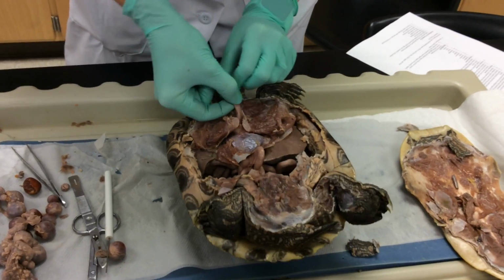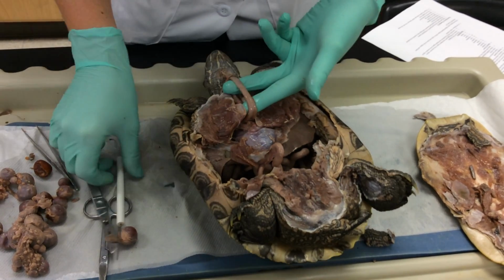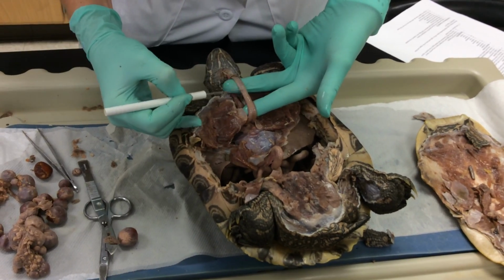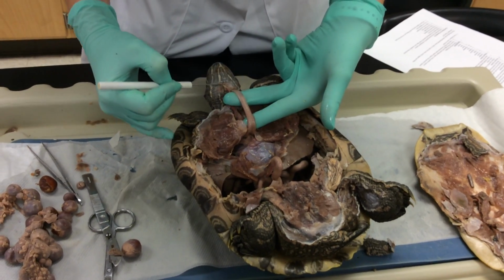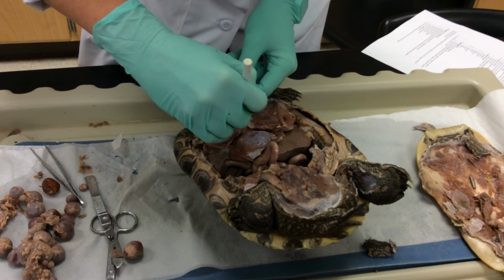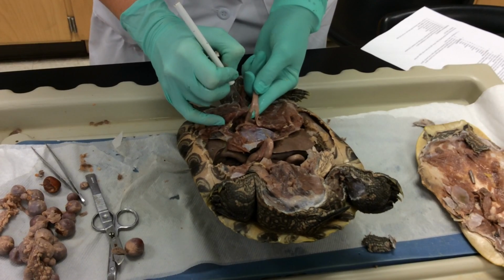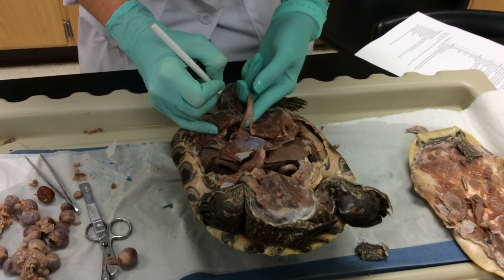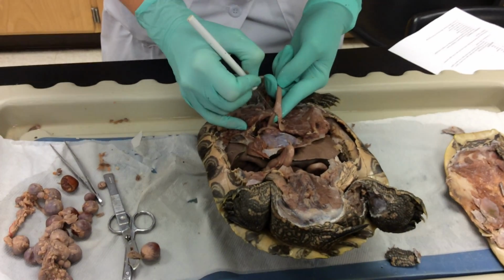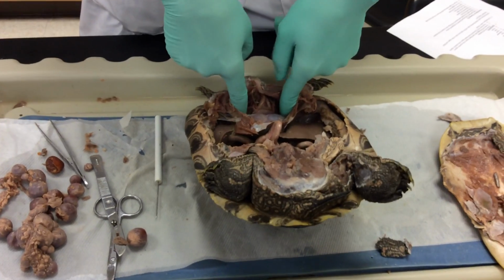The respiratory system is going to lead to this trachea. You can tell that this is the trachea because it has these ridges on it, and the ridges are the indicating structure. So air leads through the trachea. The trachea then divides, and as it divides, we call this the bronchus right here. There are 2 of them, and they each lead to a lung that's located dorsally near the carapace of the shell. So it leads back behind the heart down into these 2 regions.